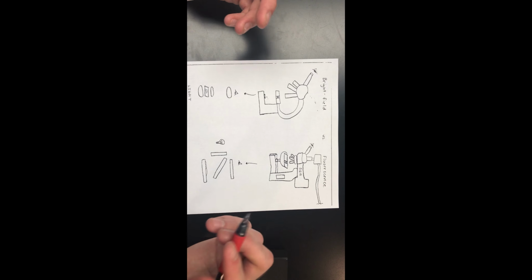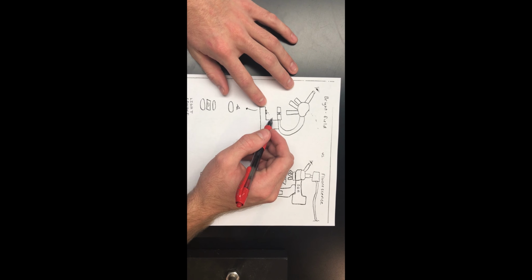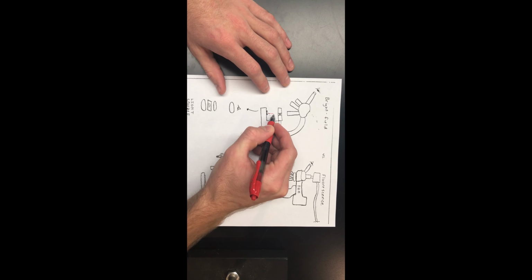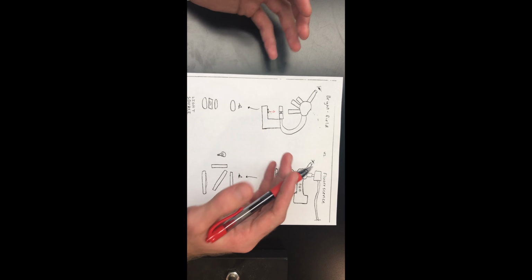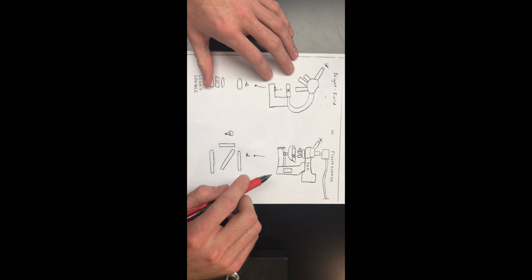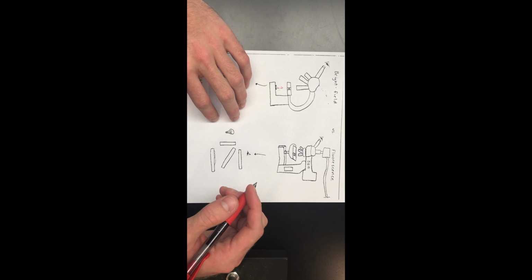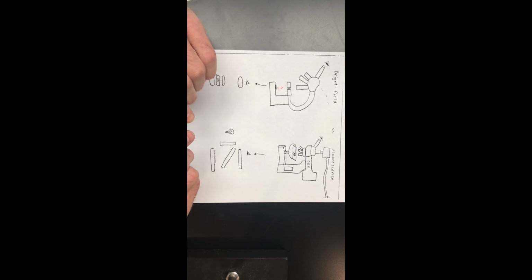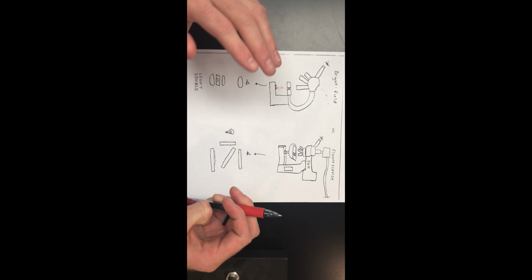The first of which is the light source that's used. So let's take a look at bright field first. Bright field microscopy takes advantage of incandescent light sources or white light sources. So your source contains all wavelengths of visible light, and you're exposing the specimen to many wavelengths of visible light. Whereas fluorescence microscopes require the use of a near monochromatic light source, which usually comes from an excitation laser or a mercury vapor lamp. If you're using a mercury vapor lamp, you need to couple that with the use of filter sets in order to filter out any unwanted wavelengths of light.